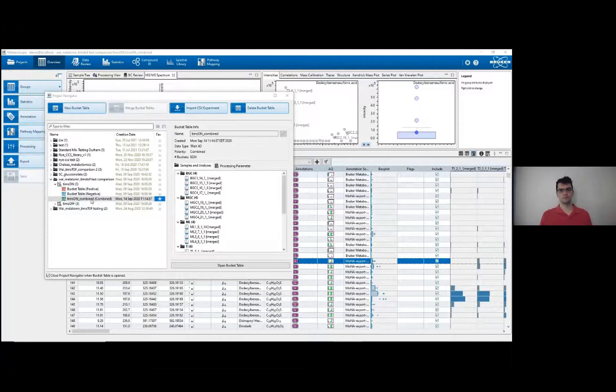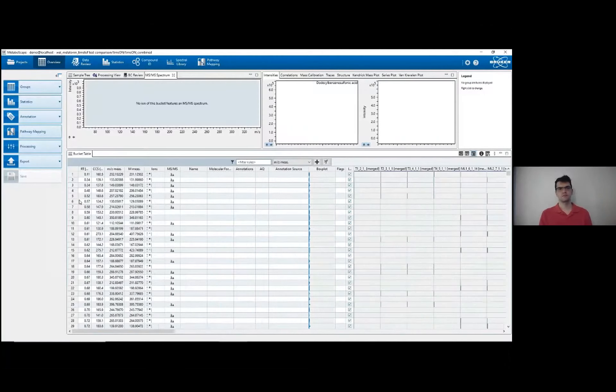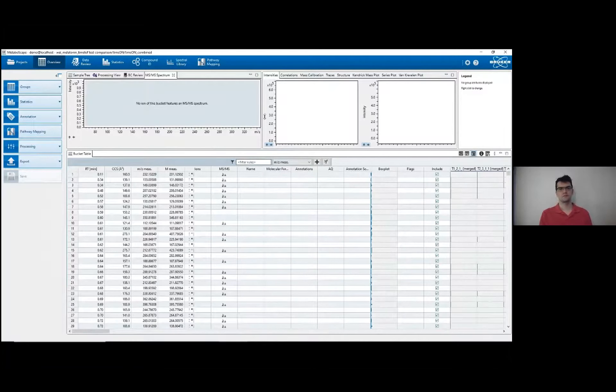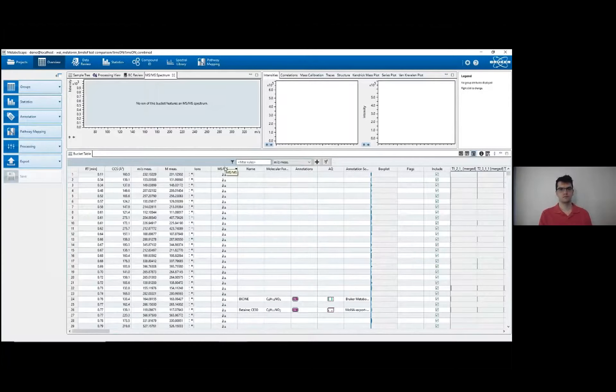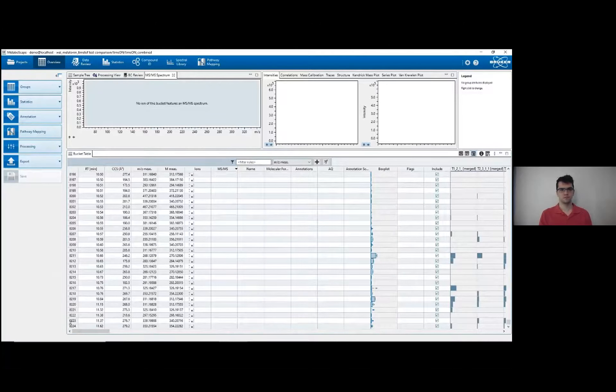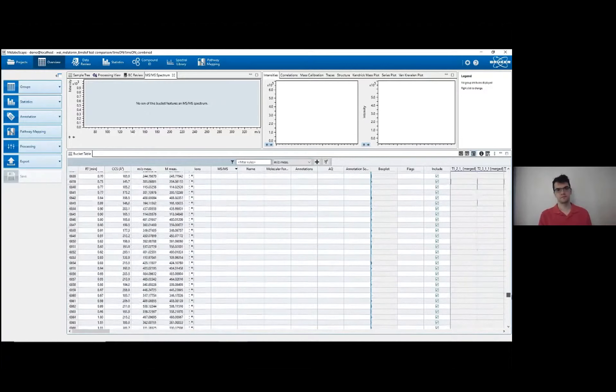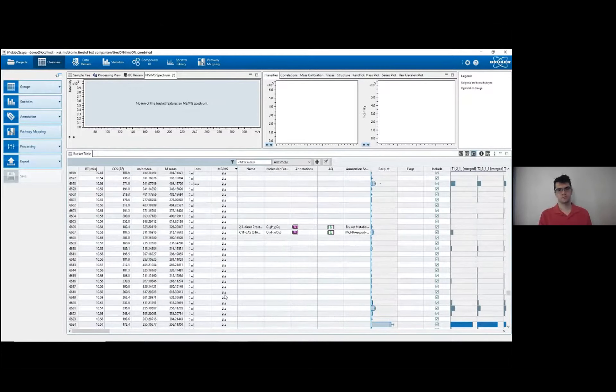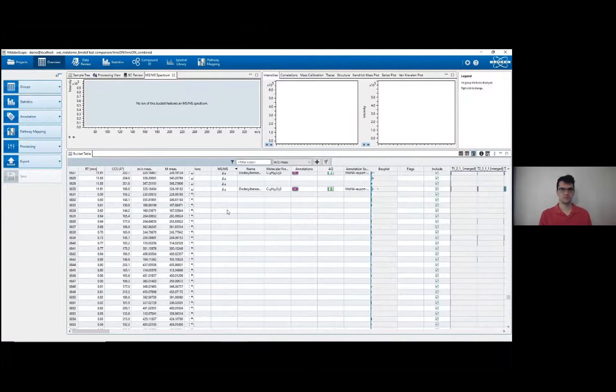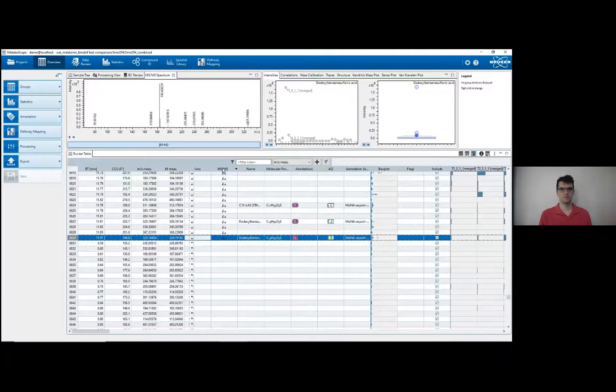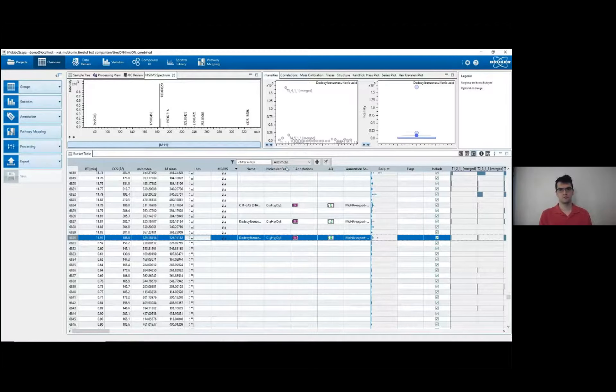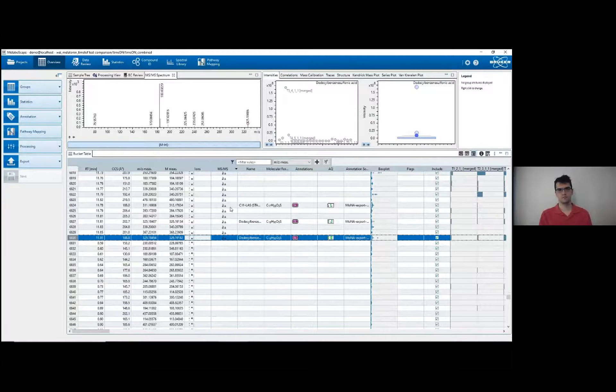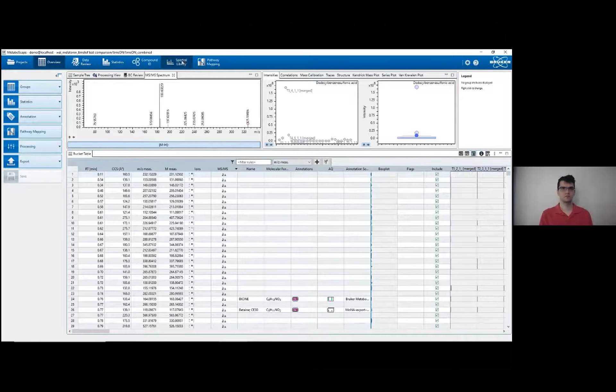Okay, now the peak identification and processing steps are done, so I can finally open our data as a bucket table. So here's the bucket table. I've already processed this for the demonstrations, but you can see that I have a lot of data. There are a grand total of 8,224 buckets, and about 6,830 of them have MSMS data. If you remember from my earlier explanations, this MSMS data is necessary for peak annotation later on. So these are the data we're really interested in. The next step then is doing that annotation using a spectral library.